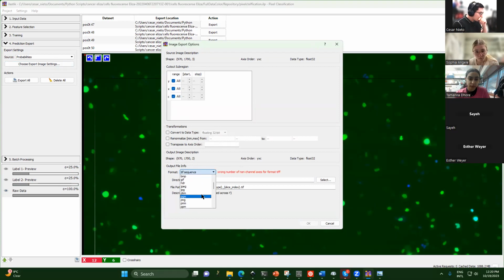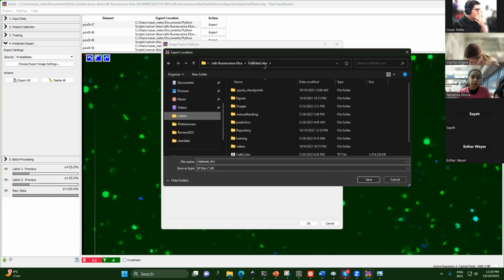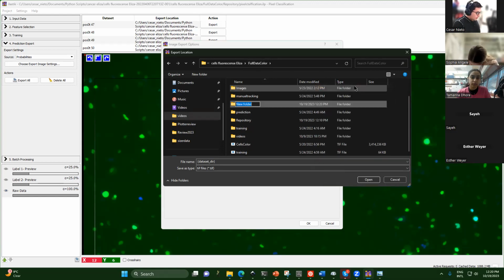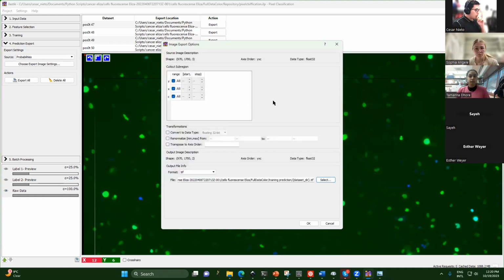Sorry, not a TIFF sequence, it's only TIFF. And I select my folder. I can make a new folder, which can be, I don't know, prediction. And you save them here.